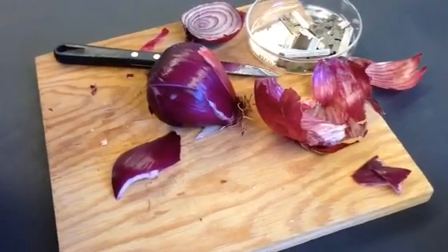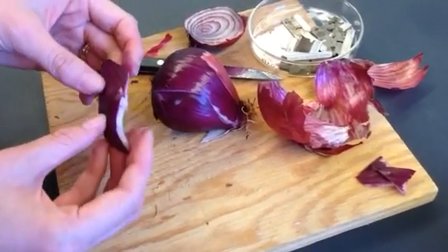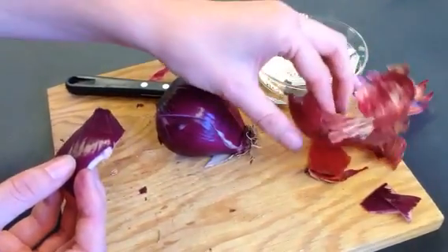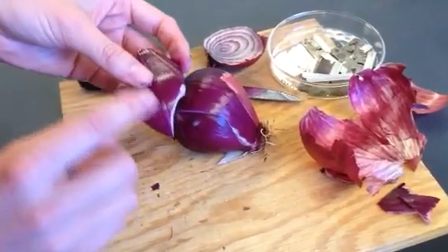In order to get the best onion cell preparation for your slide, you want to take a section of the onion. You want to avoid any of this papery purple stuff — that's not going to provide enough live cells for you to look at. What you want is this nice waxy purple substance here.